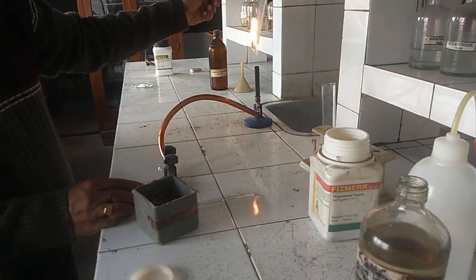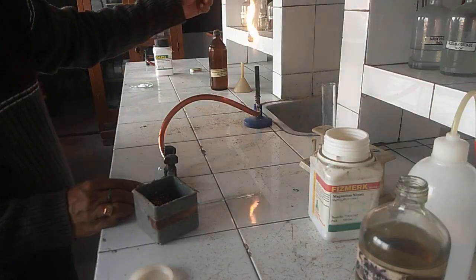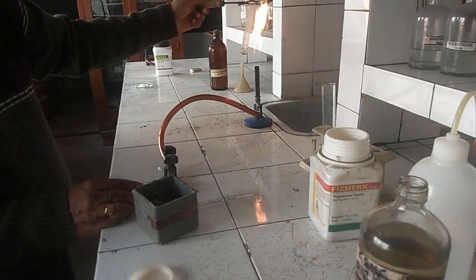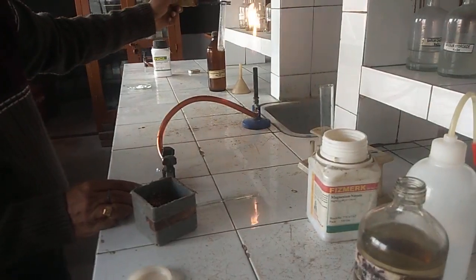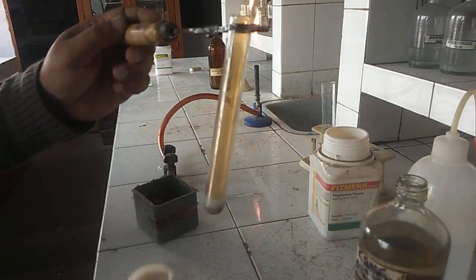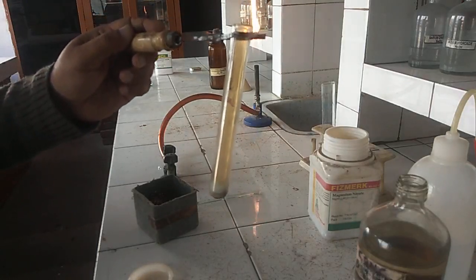Nitrate ion belongs to group 2, and group 2 radicals give colored gases on heating, as chloride ion gave a greenish yellowish color. Here we will get brown fumes, and these brown fumes are of nitrogen dioxide. You can see the brown fumes on the wall of the test tube. The brown gas, or brown colored vapor, shows the presence of nitrate ion in the salt.